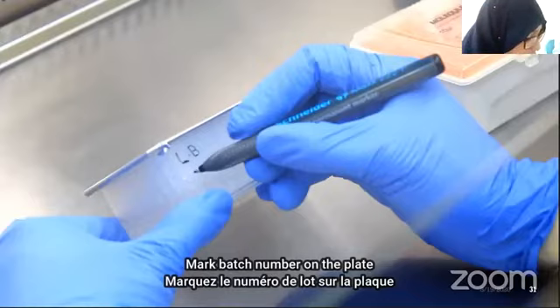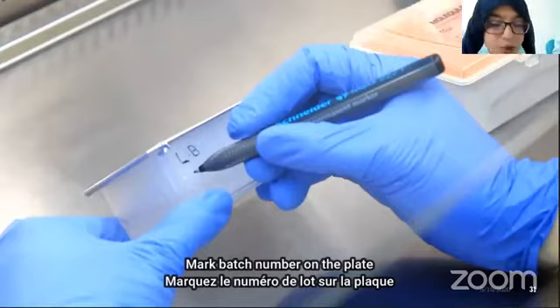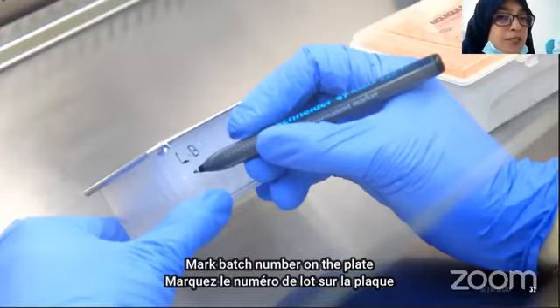Is there any worksheet for sample and control addition into the wells for easy identification? It depends. We are using the template or the worksheet, and we basically make a plate map. After sorting of the samples, we make batches of samples. Like we make a batch of 92 samples, or sometimes a batch of 32 samples.